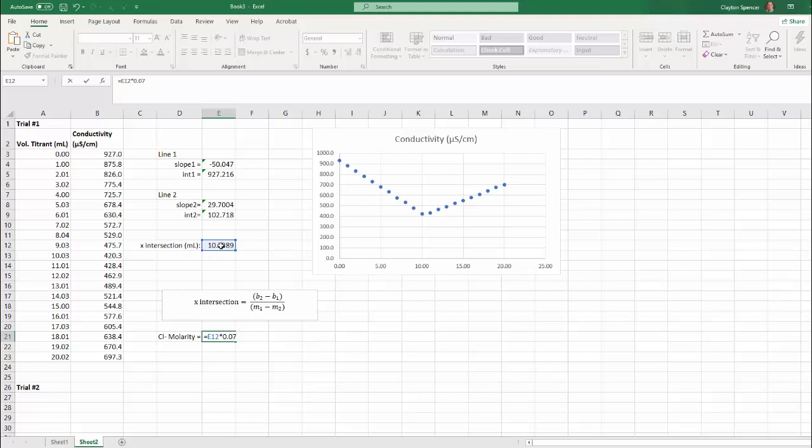Okay, so make sure that you've corrected the mass of silver nitrate that you've weighed out for purity, for buoyancy, and that you've used all your numbers as precisely as possible. All right, good. So we multiply by the molarity, and that gives us the millimoles of silver, and that's going to equal the millimoles of chloride. So we're going to divide that by the volume of the chloride sample that we took. Let's say for our example we took 3 milliliters, and we just hit enter then. And there's our chloride molarity. So our chloride molarity is 0.24 molar. Type my unit to the side if I want.